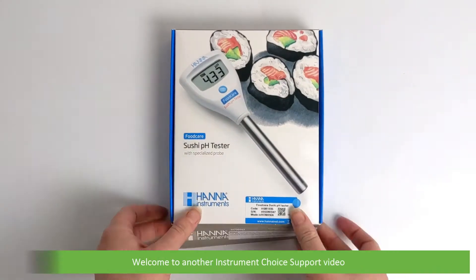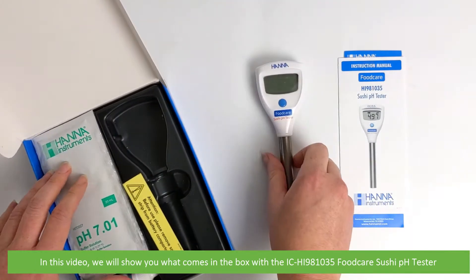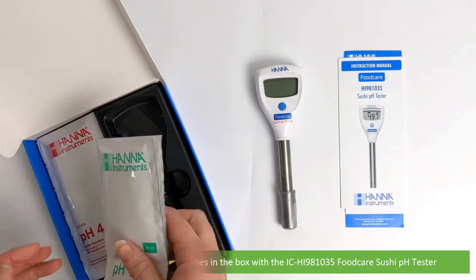Hi and welcome to another Instrument Choice Support video. In this video we'll show you what comes in the box with the IC HI-981035 Food Care Sushi pH Tester.